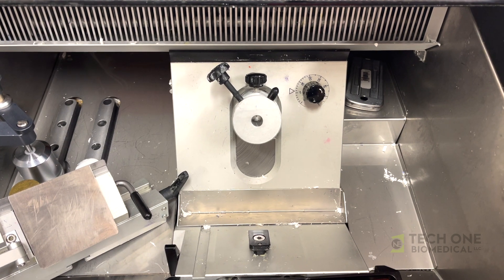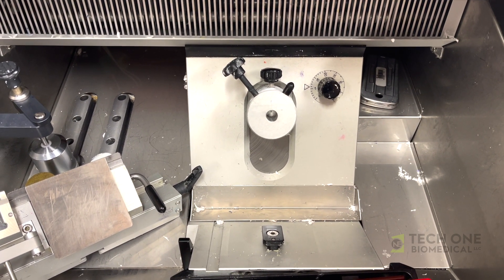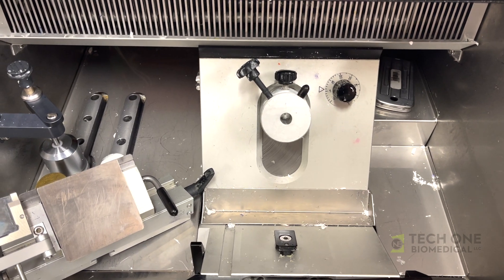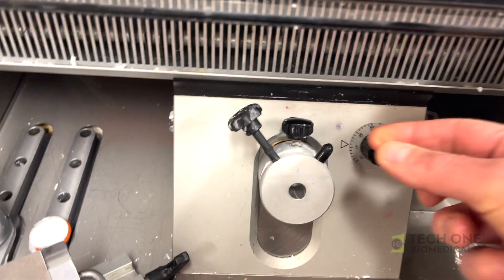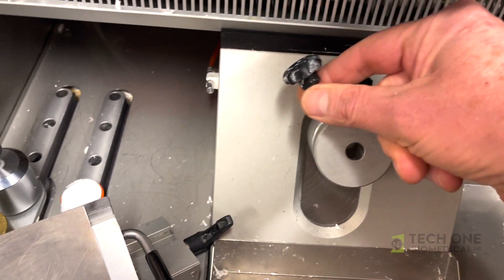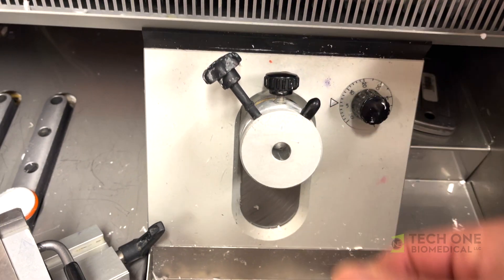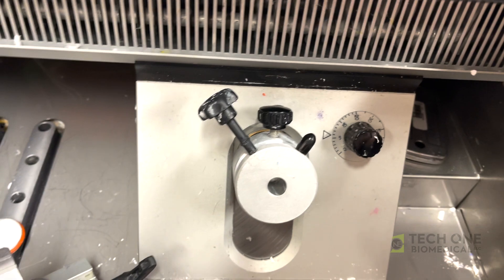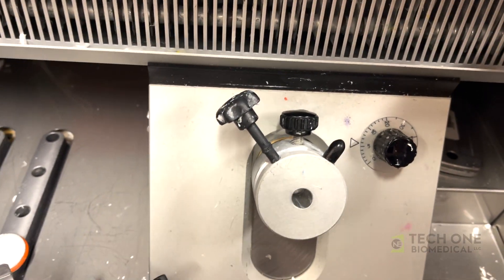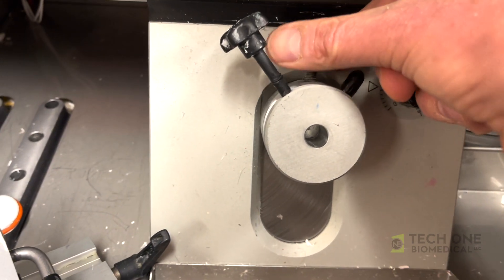Hey guys, I'm coming to you live from a Mohs lab. The problem they're having is they're not getting consistent sections, and there are actually two reasons for this. Number one is that they've got a knob up here that locks the orientation head down, and unfortunately no matter how much you tighten it, it's not going to tighten very well. That's why they switched to a levered version where you could really get some torque on it.